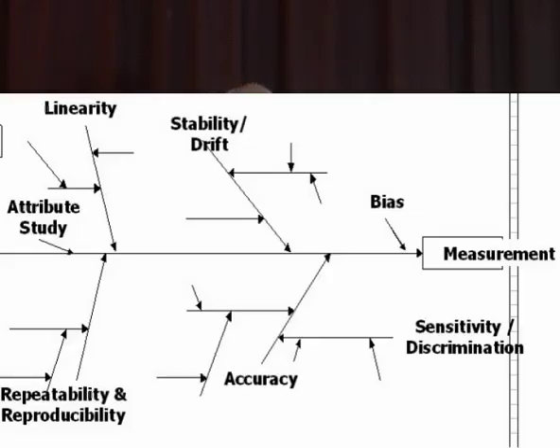And finally, they have something called attribute study. Now, what does that mean? They look at the total environment. Now, in the attribute study, they would include everything except the instrument. For example, analyst to analyst.